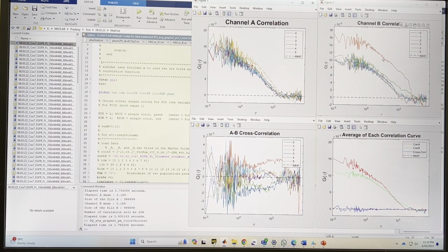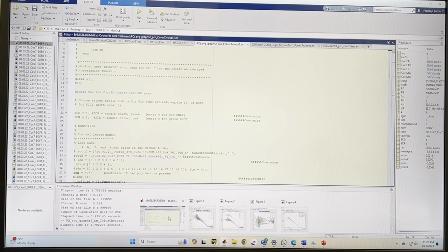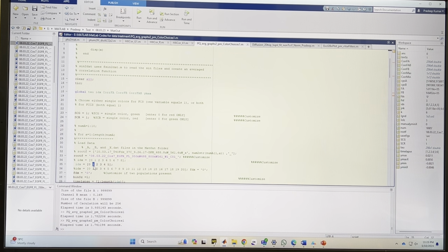So you can see here, this is 1, which is out of shape, 1 and 2, you can see here. So we'll see which color that is. This is 1. Okay, so if you want to make your data clean, then you can remove this. This is your personal choice, which one you want to remove. I feel like this is out of place, so I'll remove this one. I'll double click here, and then backspace or delete, and then run again.